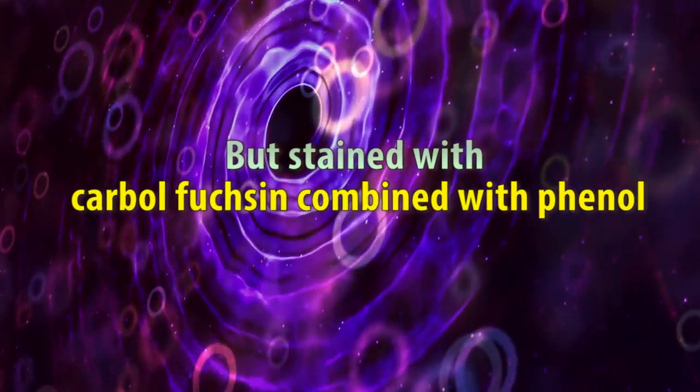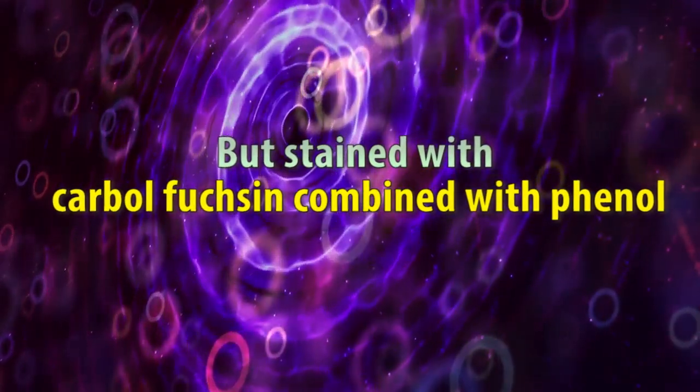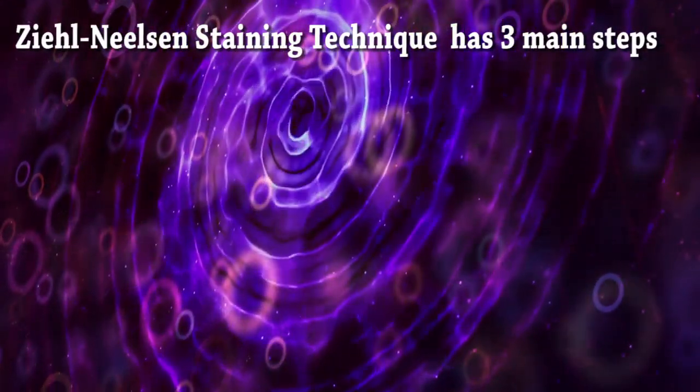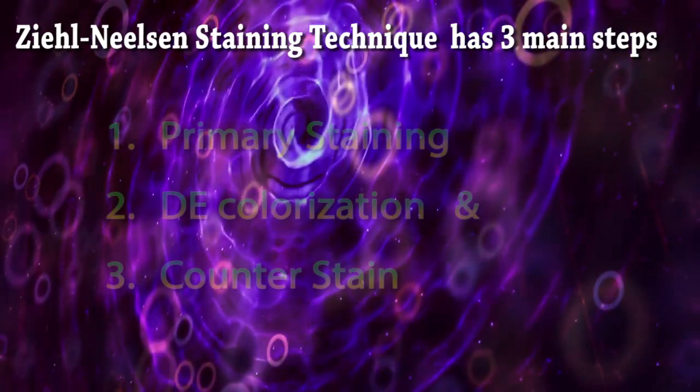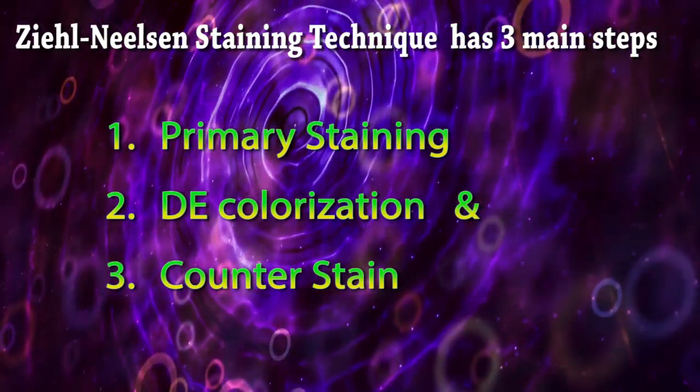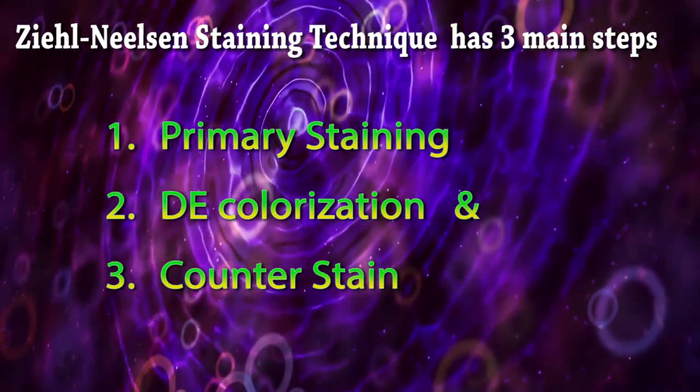But stained with carbolfuchsin combined with phenol. Zeal-Nielsen staining technique has three main steps: primary staining, decolorization, and counter stain.